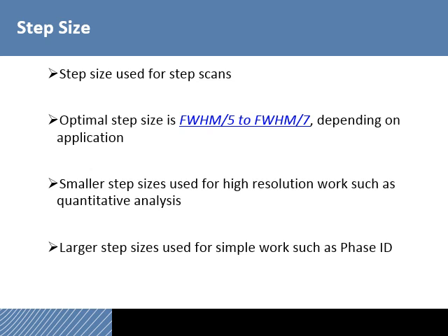It actually operates, I believe, with a step size that is an integer multiple of 0.008 degrees. So you'd have 0.008, 0.016, and so forth. Smaller step sizes are used for high resolution work, such as quantitative analysis, and a larger step size can be used for quick scans or just doing basic phase ID.